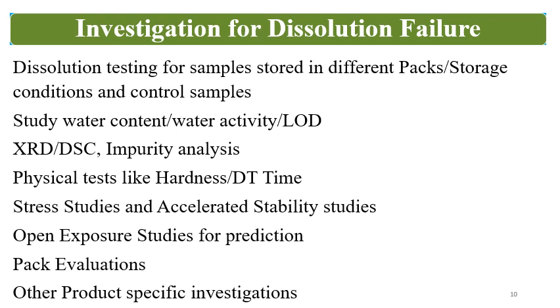Then how to investigate the dissolution failure? If you have a tablet formulation, let's say for example it is an IR tablet, and if it is failing in the dissolution specification, then how to deal with that situation? How to investigate? Dissolution testing can be done for the samples stored in different packs and different storage conditions, and these are compared with the control samples. Study the water content or water activity of the formulation, study the LOD, and compare it with the initial control samples.